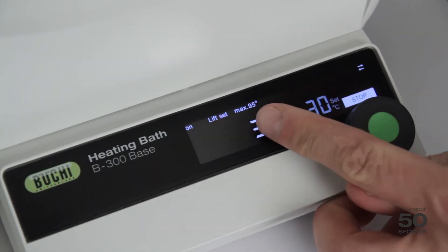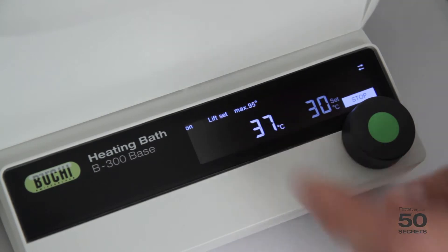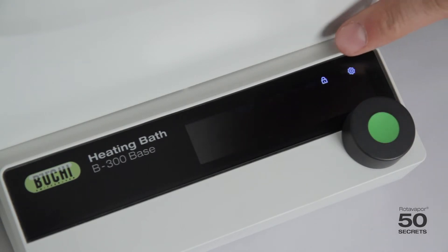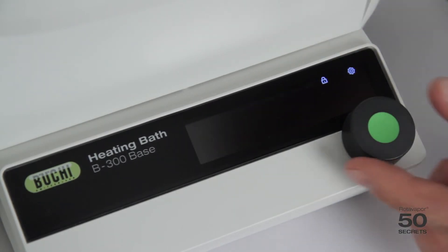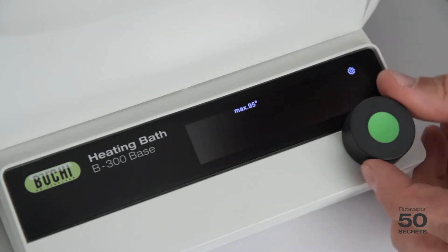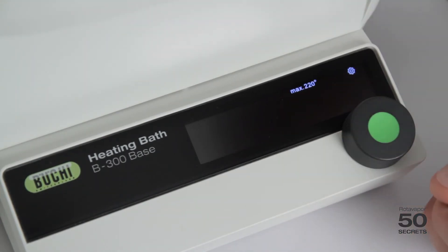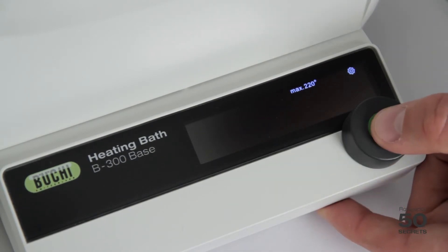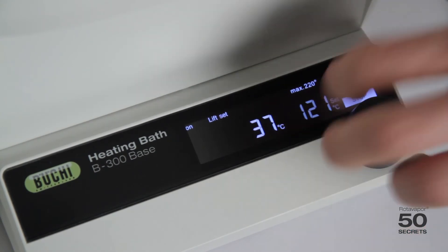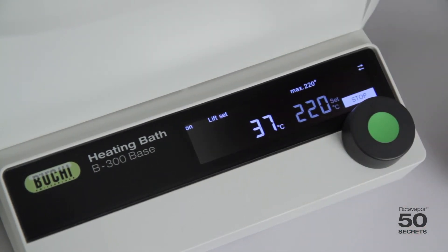Now a few topics on the settings. If I would like to go up to 180 degrees, for example, I just do a long press. Then some numbers start blinking and I can use the wheel to select 95, 180, or 220. If I select 220, it's set to 220 and now I can go up to 220 degrees set temperature.